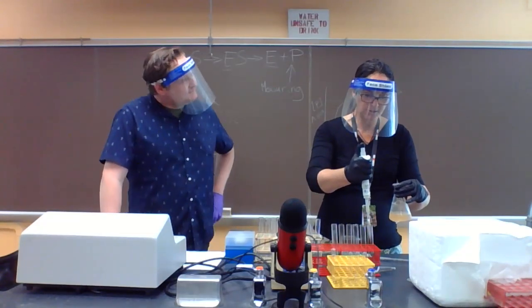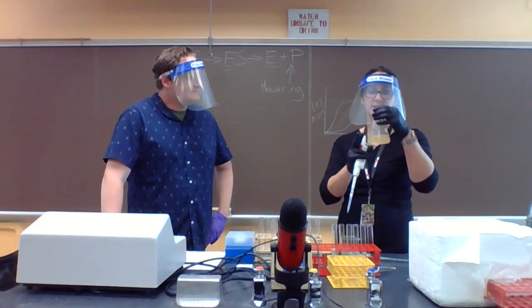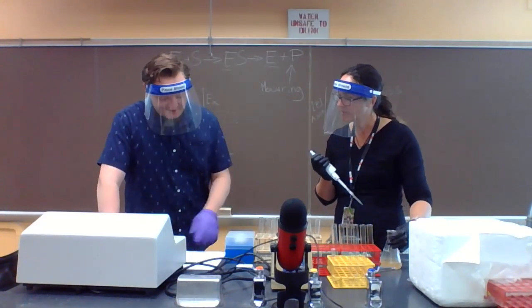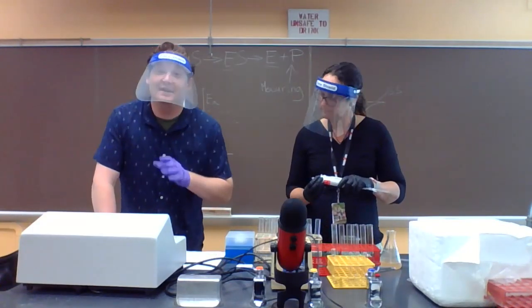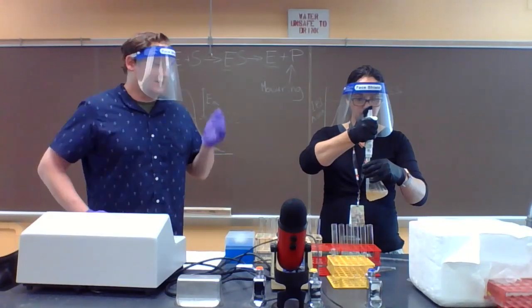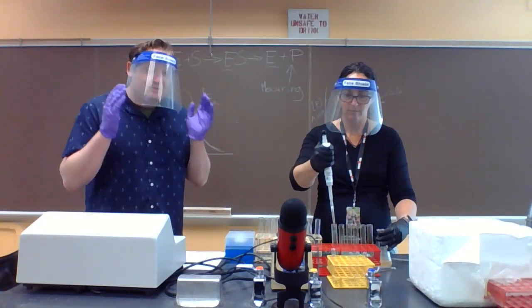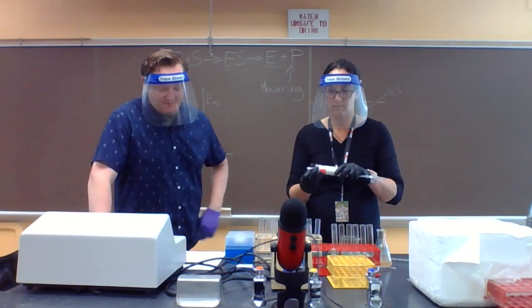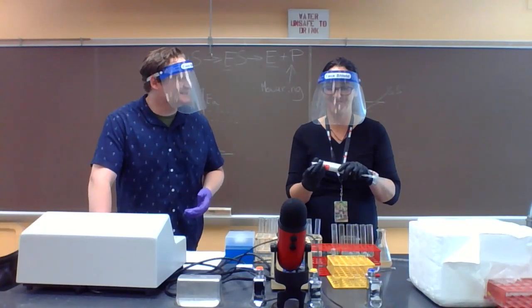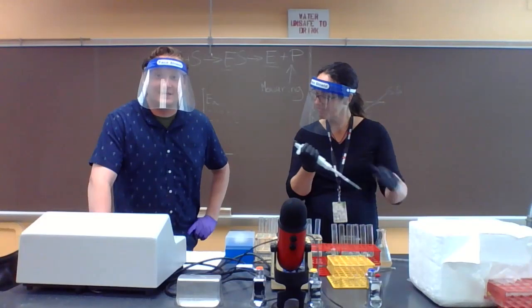And that's why we do tube 1. Tube 1 is really there to correct for any of the endogenous product that's forming in here. Makes all the sense in the world, because you can see in tube 1 there is no catechol added. And that's why tube 1 serves as our blank. The color change that is due to endogenous catechol should be more or less consistent between all of our tubes, at least we're hoping as much. Or at least all the tubes containing unboiled extract, I should say.